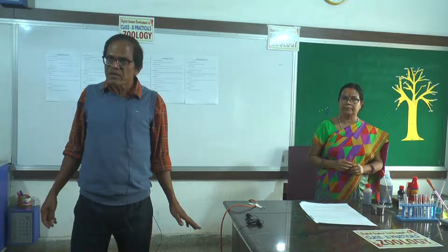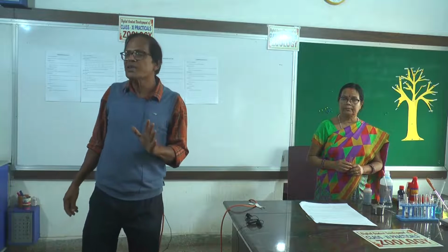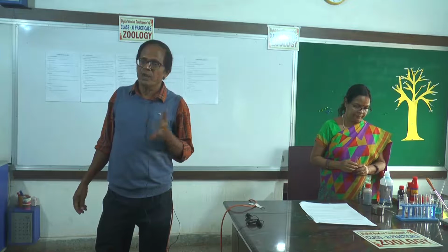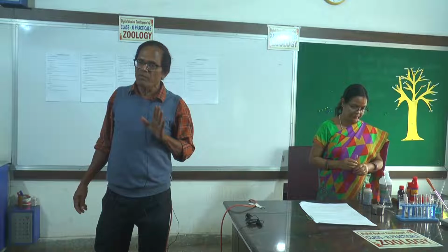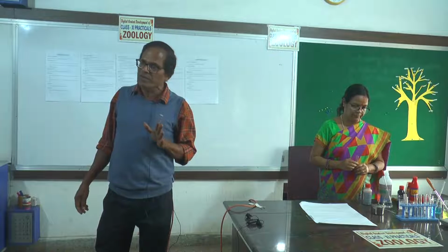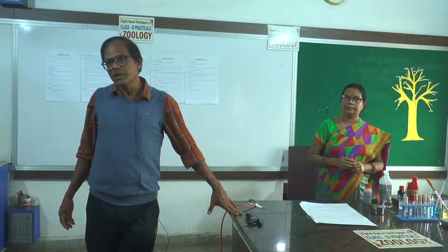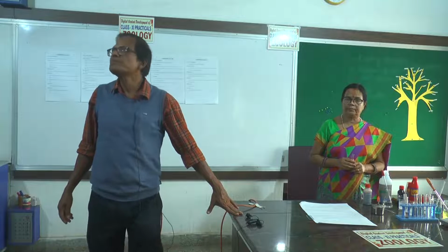Metal ions means the ions which have metals with variable valencies, for example copper, silver, etc. These can exist in variable valence states. Therefore, they can be reduced by glucose in solution.